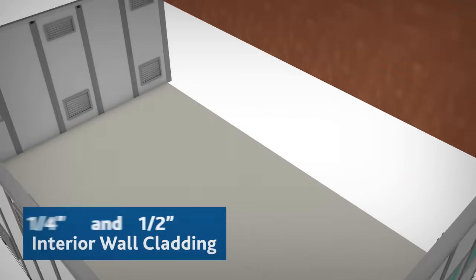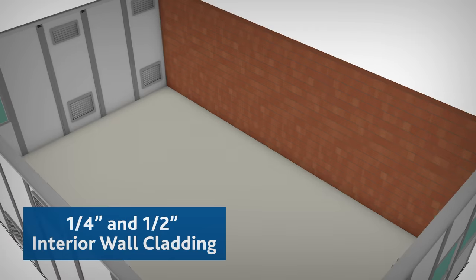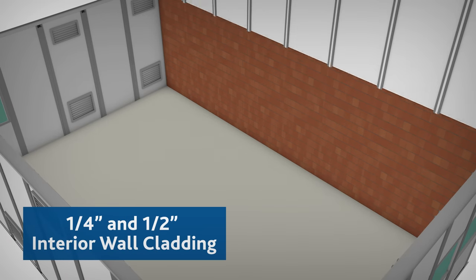Our quarter-inch and half-inch furring wall can be used to effectively clad existing walls.